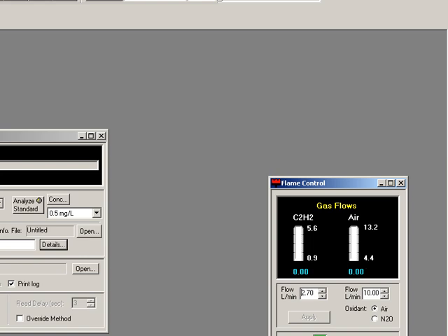And you can now hear that the airflow stopped, and finally the switch indicates that everything is off. At this point, if you want to, you can bleed the gases, but you should not do that until you've completely turned all the tanks and the air supply off, because otherwise you'll just be running uncombusted gases through and creating a hazard. So you normally can just not worry about that at all.